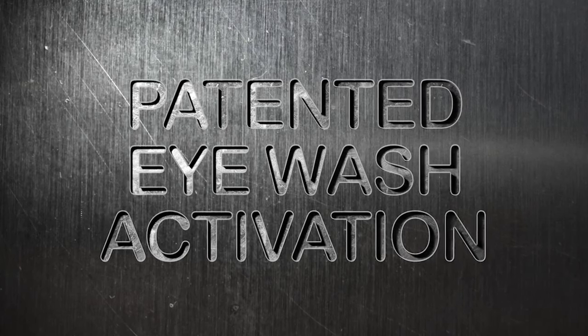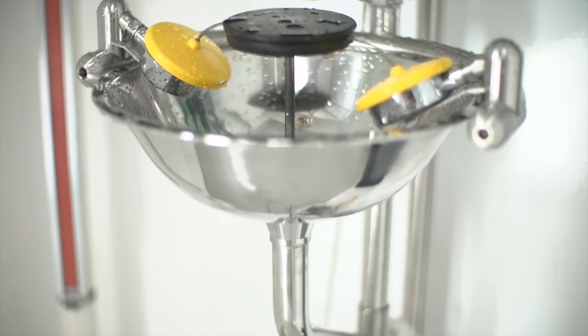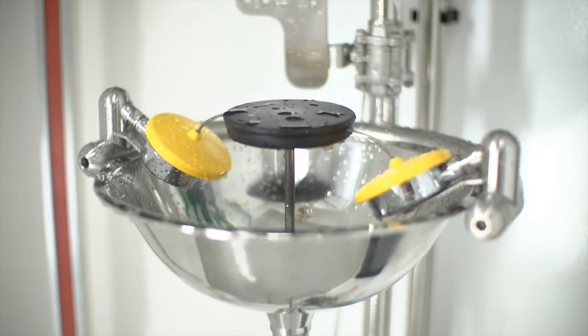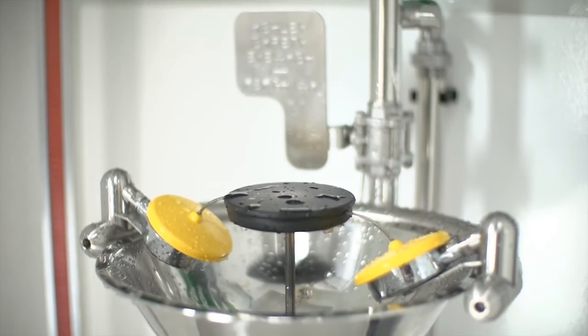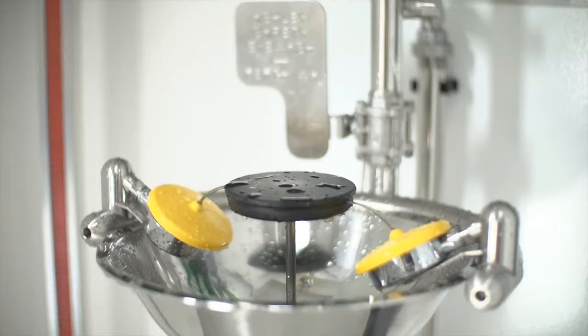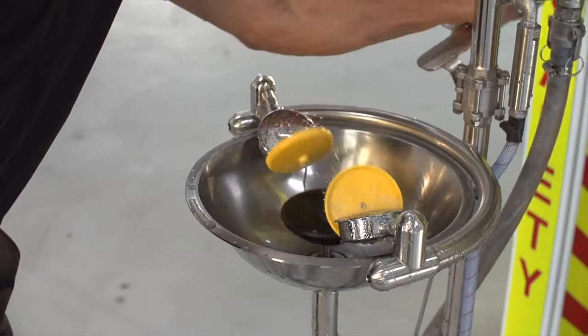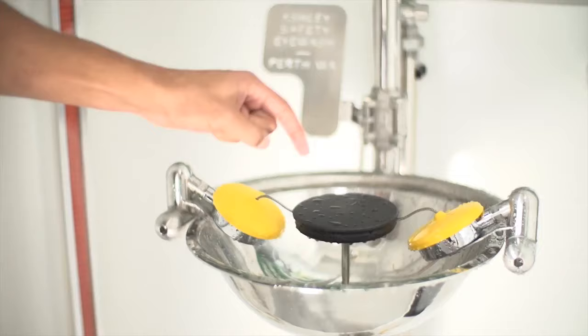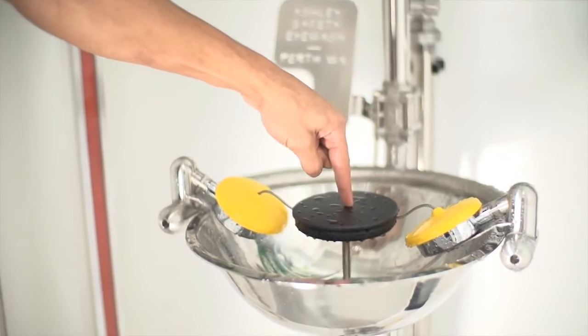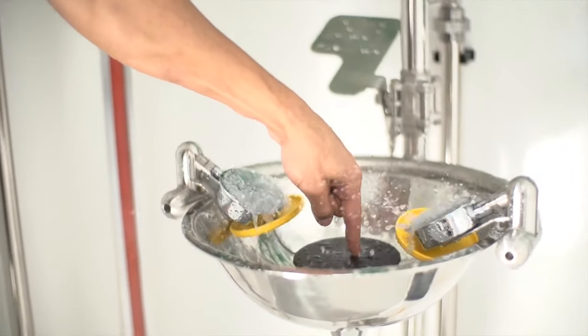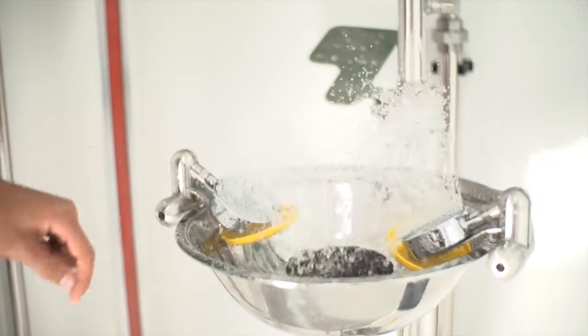Patented eyewash activation: Ashley's unique design for activating the eyewash is revolutionary, and three methods for activating the eyewash are now available: foot pedal, hand pedal, and the patented push button. The push button may be activated by hand, finger, elbow, or head if required in an emergency.